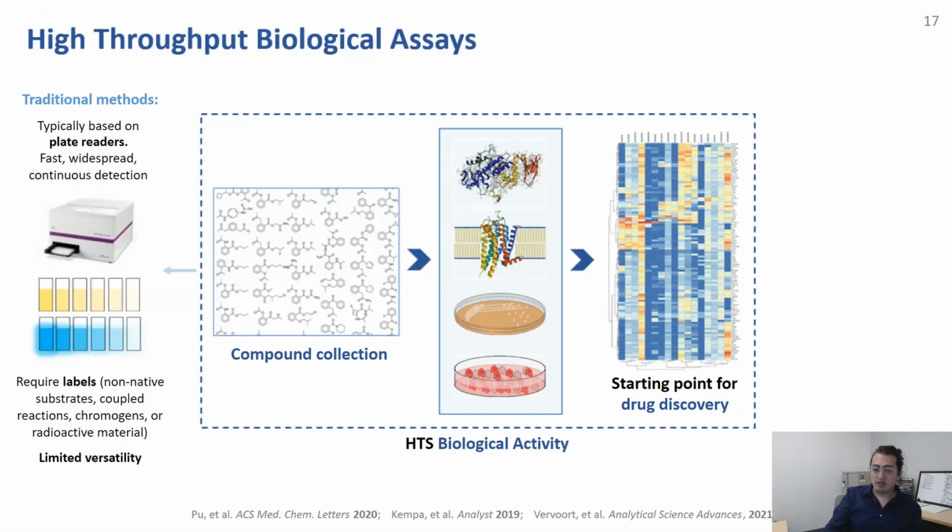And this limits the versatility of these assays. You're going to have to start from scratch every time you develop a new one, every time you change the enzyme, every time you change the substrate. And it also introduces more work, more expenses, even safety concerns to this assay. And furthermore, it introduces interferences. So what do we want to do?